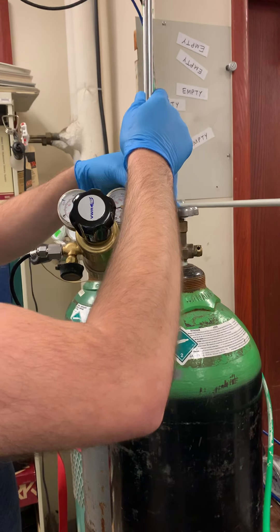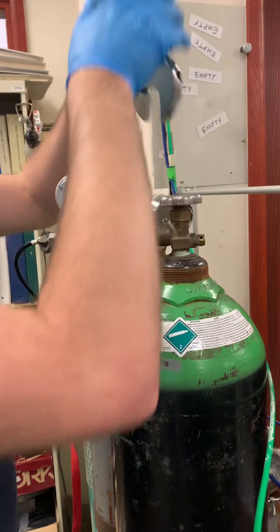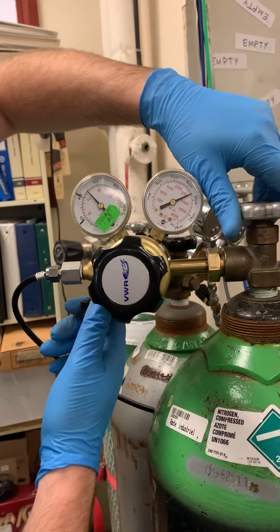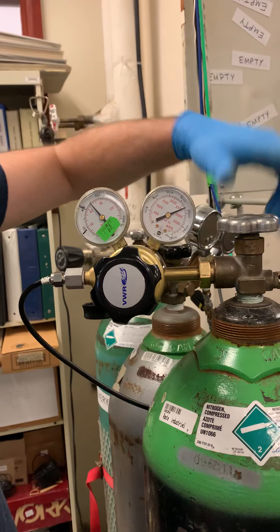Tighten it up. Now I want you to see what happens when we turn on. There — see immediately the difference between full and empty.